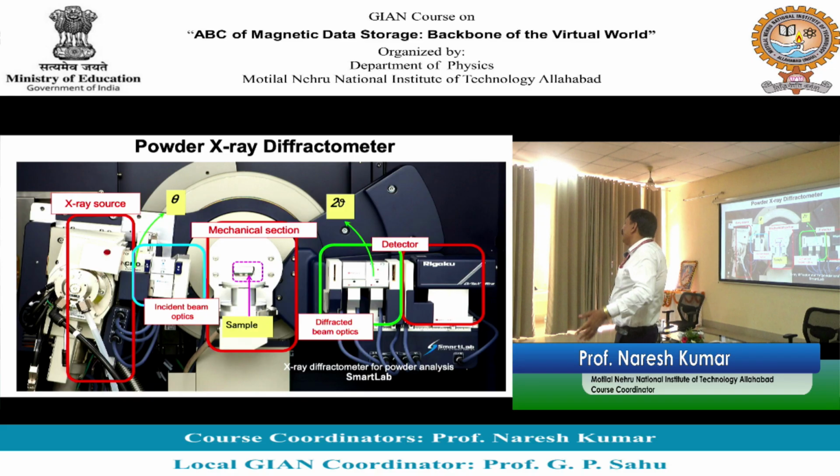मुझे background noise मिलेगा. So if let's say I am a layman, जैसे हम लोग एक्सरे डॉक्टर के पास जाते हैं, ECG लेके जाते हैं, पता नहीं क्या लिखा रहता है, ऐसे हमारे पास एक्सरे भी लेके आते हैं. अब तो बहुत एडवांस हो, शुरू में बड़ा मुश्किल था. So if I have a material sample and X-ray has been done, just by looking at the X-ray, the very first information that you can have is whether the material is crystalline or amorphous. कैसे पता चलेगा सर? If it has a sharp peak, it is crystalline, otherwise amorphous.